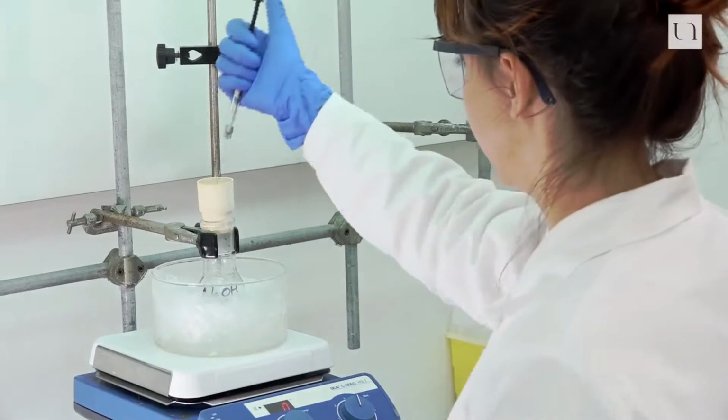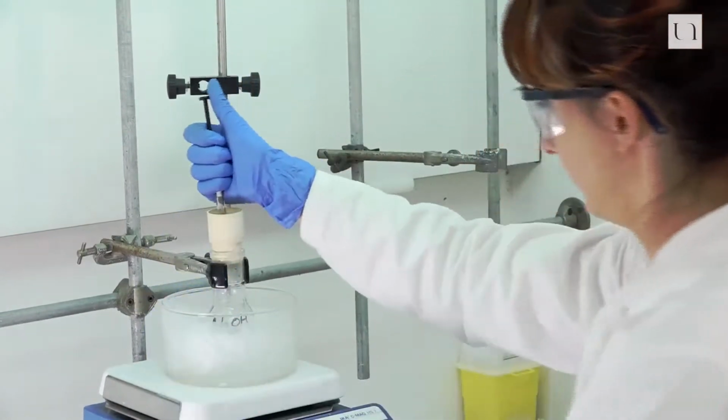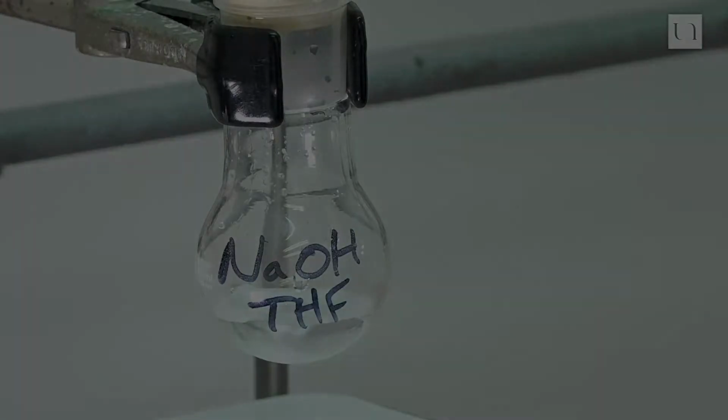Then, add the propargyl chloroformate dropwise over a 2 to 3 minutes period under stirring. Warm the reaction mixture to room temperature and continue the stirring for 10 hours.